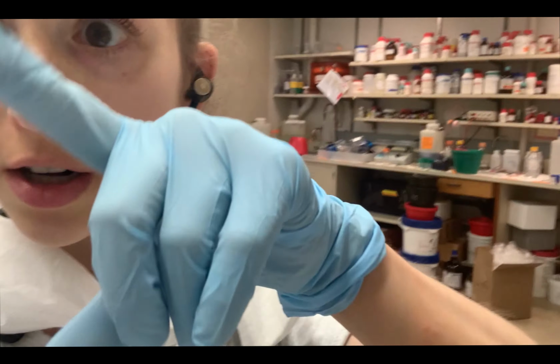They're in long racks, and the machine takes them one tube after another. Each time, it's counting the light that's given off thanks to the scintillant. In the scintillant, in addition to solvents that help dissolve the paper and the substrate you put in the tube, there's also a fluor, a molecule that can fluoresce.